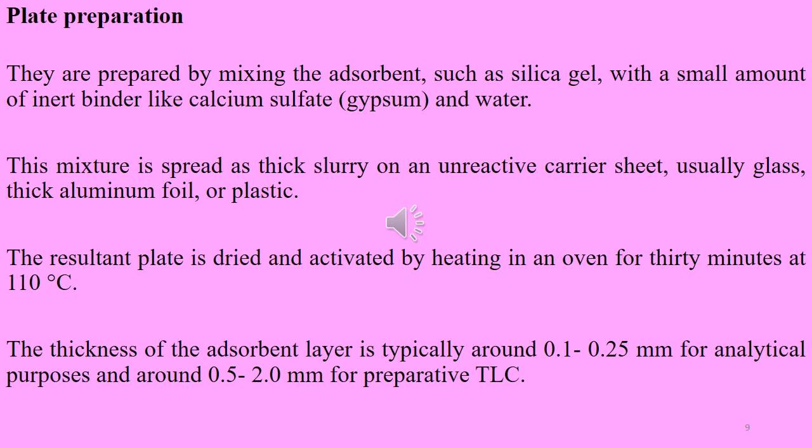If the sample is too concentrated, it will run as a smear or streak. If it is too dilute, you will see nothing on the plate. Sometimes you will need to use trial and error to get well-sized, easy to read spots.